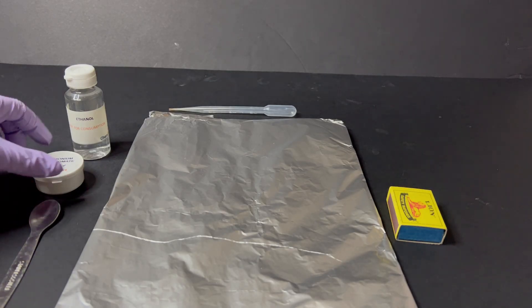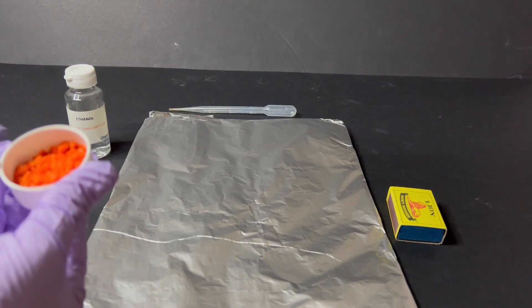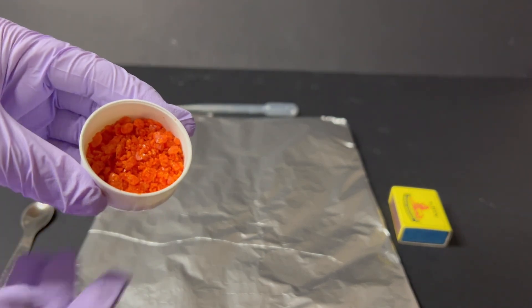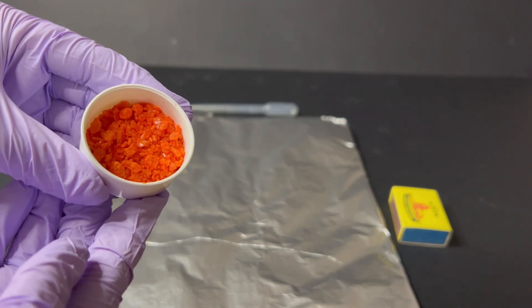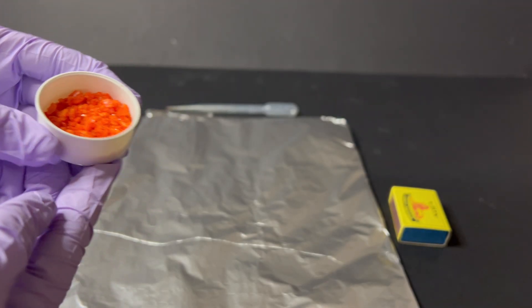Here I have some ammonium dichromate crystals. Take a close look. They are bright orange in colour and have a crystalline texture. These crystals are our starting material for this experiment.